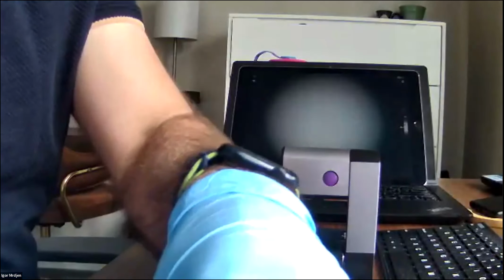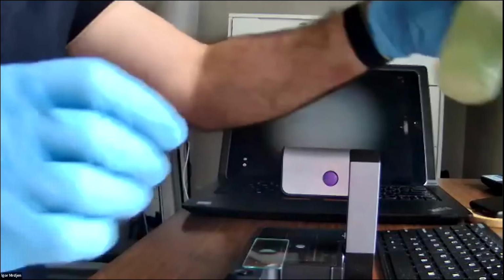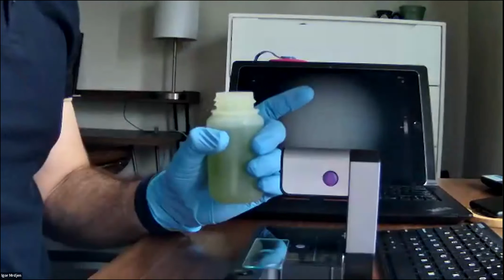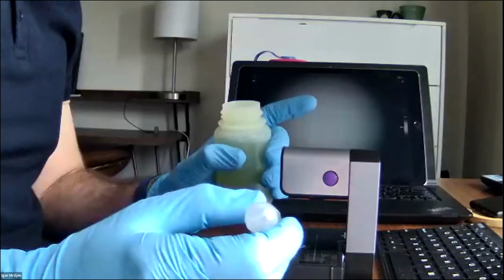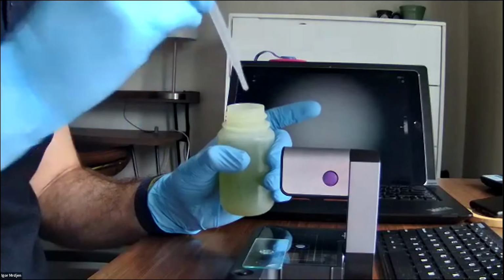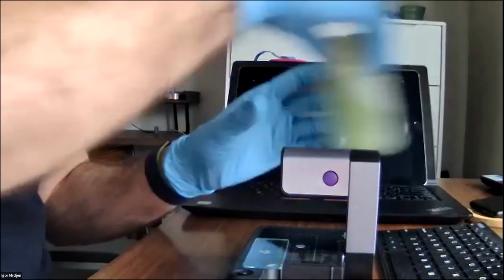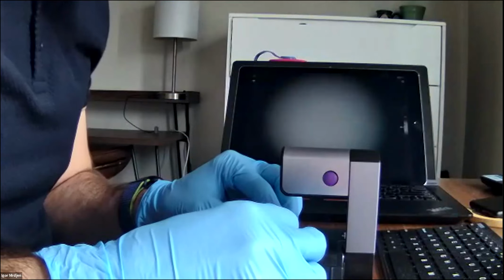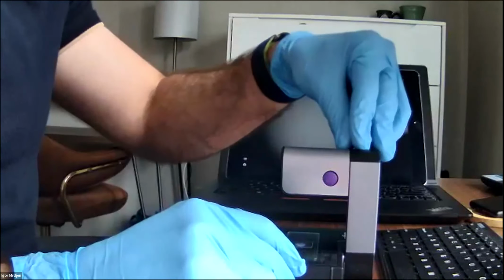Okay, so I am going to take my microscope slide and stick it here, and then I'm going to take a sample from my Microcystis heavy bloom that I collected yesterday, and just put 2 drops right onto that slide. Okay. All right, and now I am going to cover it with a cover slip, and hopefully, I think there's some good chunks there that I can zoom in on.